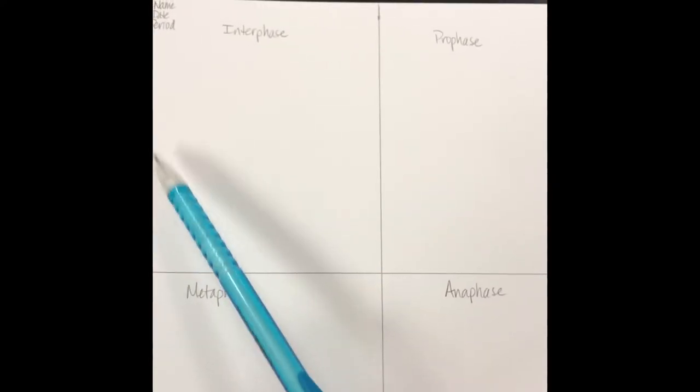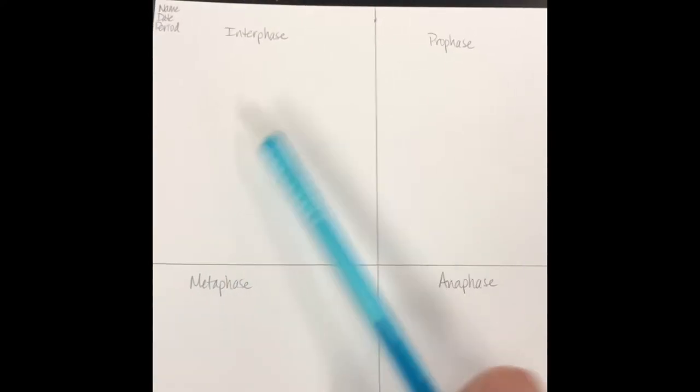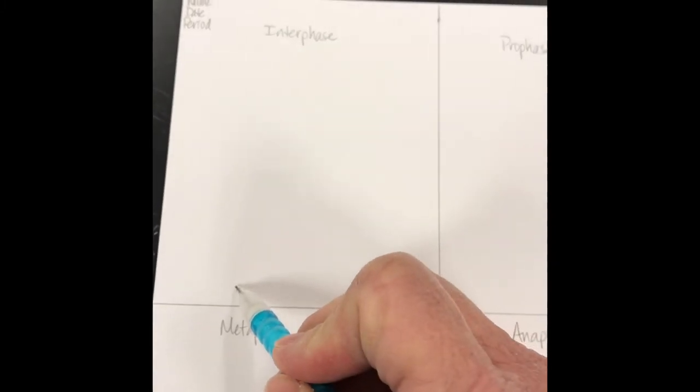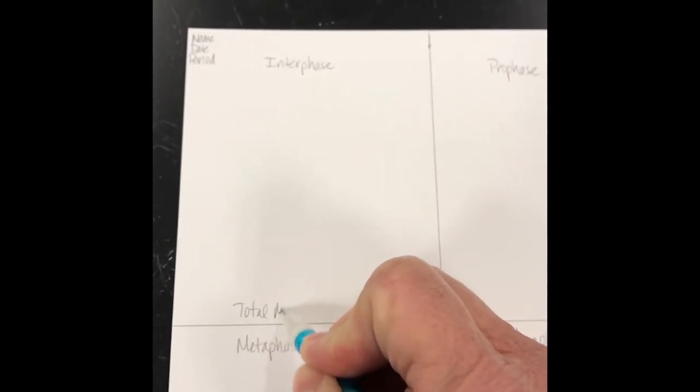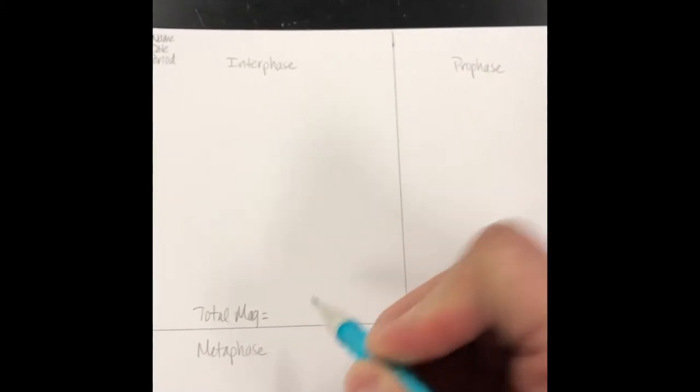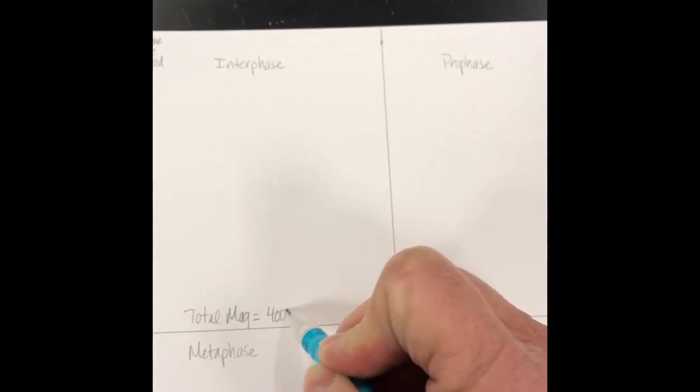So we're going to look for phases. Interphase, we're going to put in this first quadrant, prophase, prometaphase. We have a metaphase, an anaphase, and then this one's going to be telophase with cytokinesis. Now, at the bottom of every quadrant, I generally like you to put total magnification. So I always go total mag equals, and we're drawing, like I said, on 400x. So you need that below every picture.